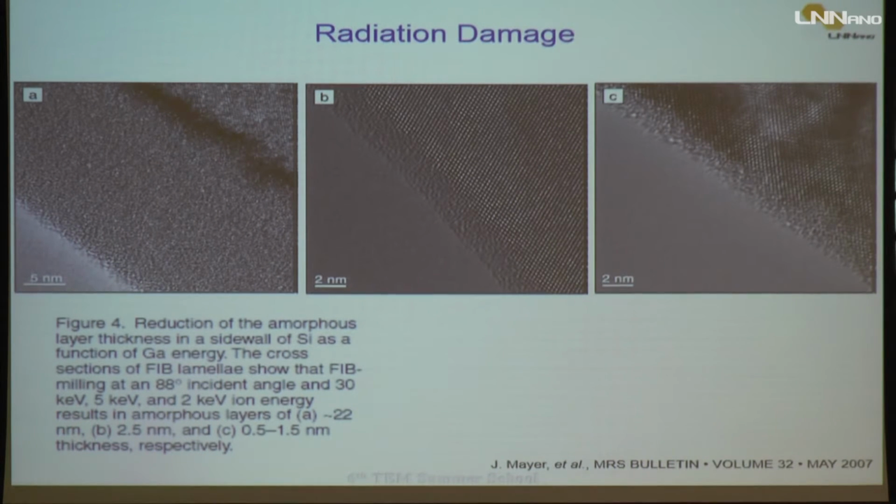I mentioned the radiation damage that this technique may cause. Here I have a comparison of the same kind of sample.